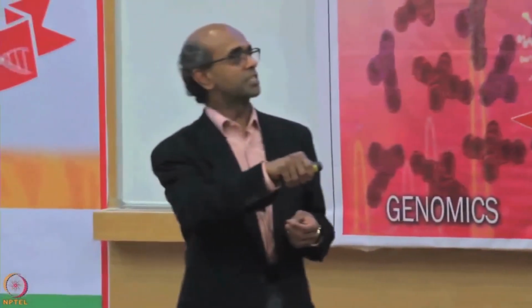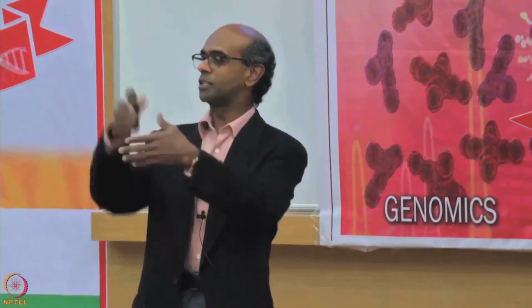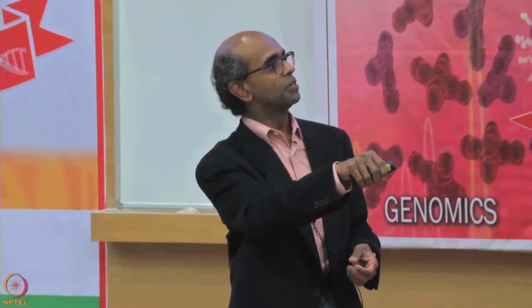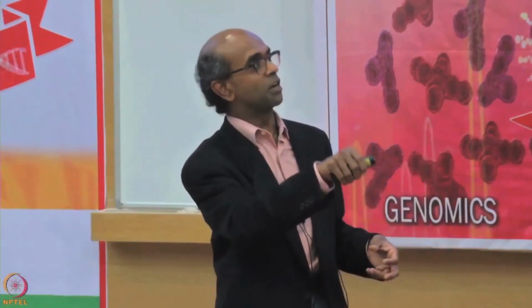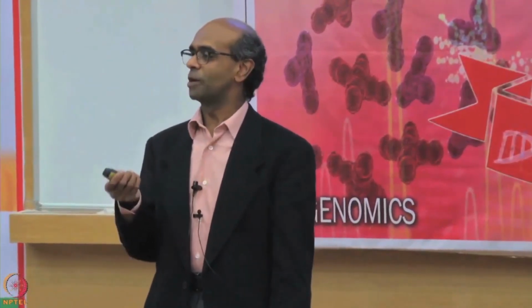What that does is it says, okay, you told me there are two distributions. Let me look at the data and figure out where the two distributions are, what their mean and standard deviation are. So this procedure will come up with this red curve which says my mean is 0 and the standard deviation is say 1. And then the blue curve, which represents the proteins that are changing, for which the mean is also 0, but the standard deviation is 100 because they are very spread out. Then you say, okay, the red curve represents the proteins that are not changing, so I'm going to use only the red curve to do my normalization.